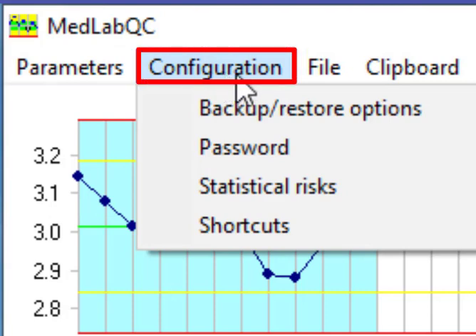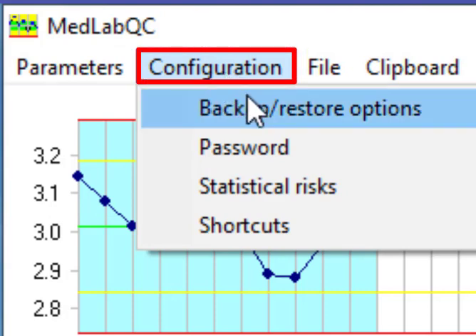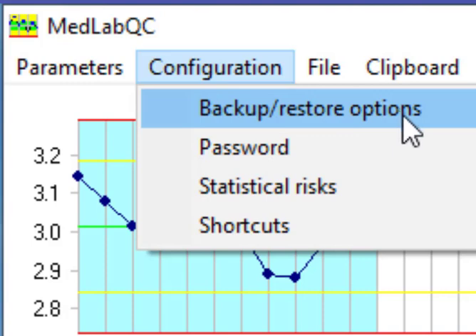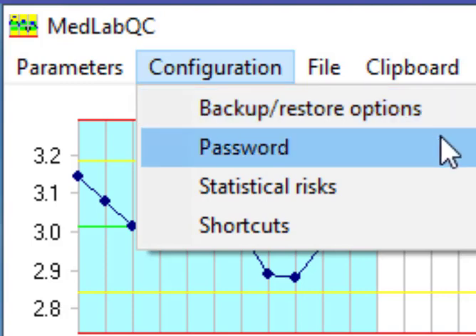On the configuration part we have backup, password. We can specify and determine password for each part of the software in order to not allow everybody to make changes on the data.